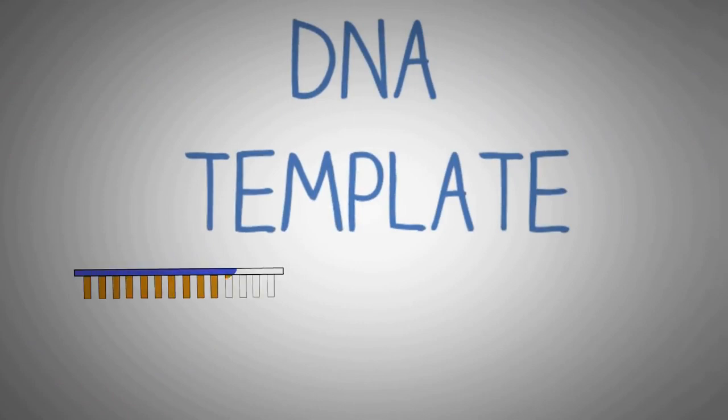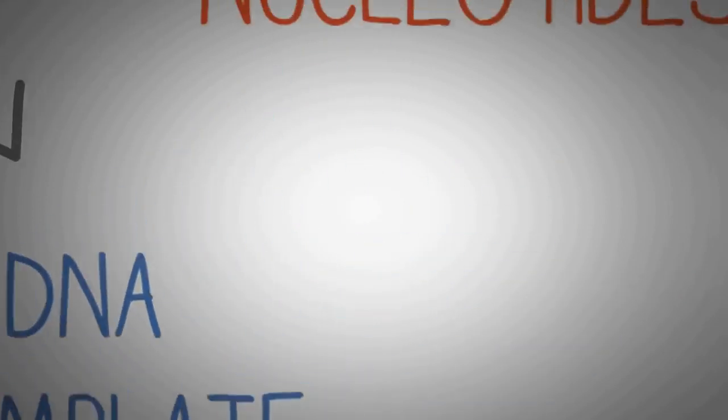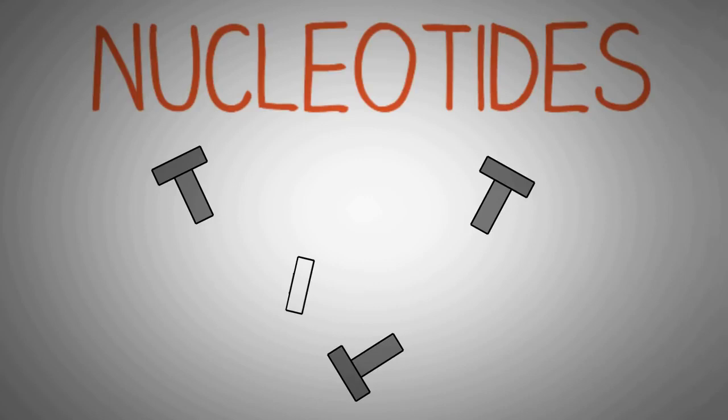DNA template is the segment of original DNA which we want to amplify. And nucleotides, as we already know, are the basic building blocks used for DNA synthesis.